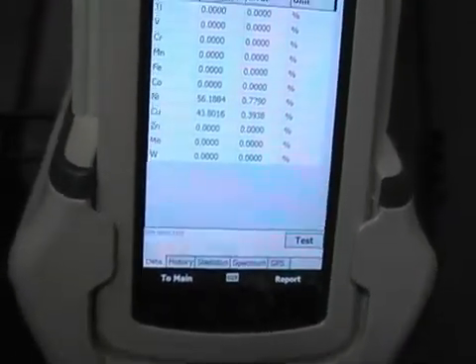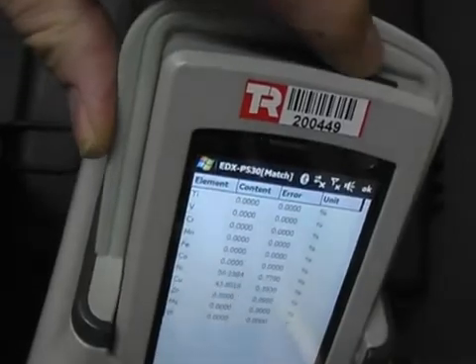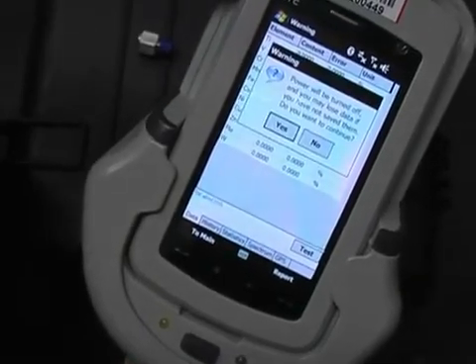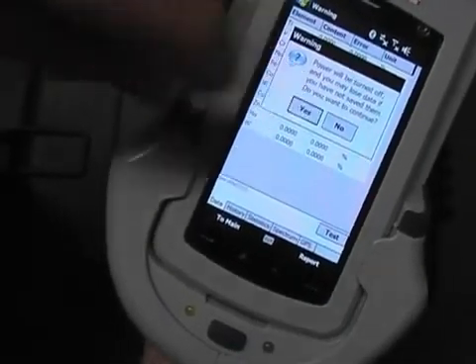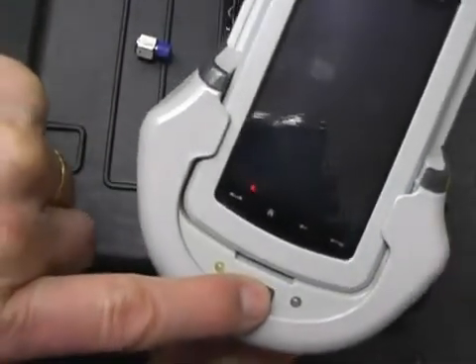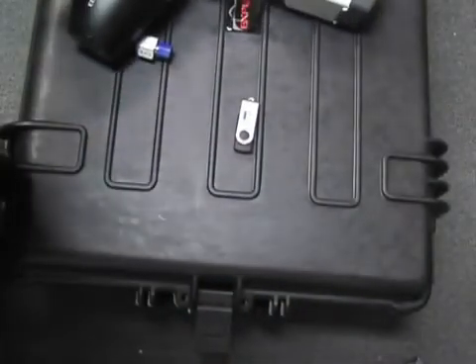To turn the instrument off when you've completed, simply hold this button in here, and hold that button in there. When you hold this in, it requests — do you really want to turn it off? Yes. And this button here, push it in. Finish the test. Very simple to use.